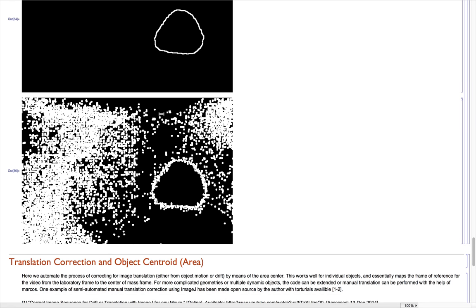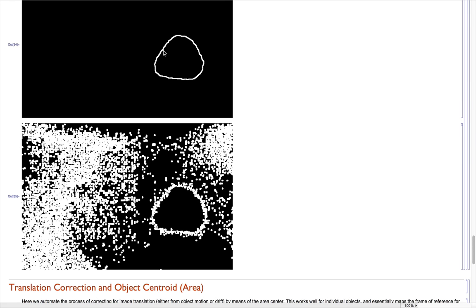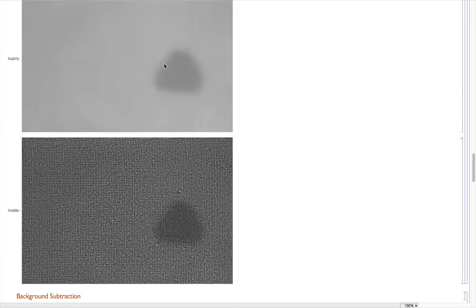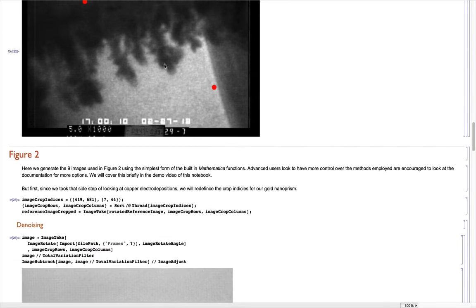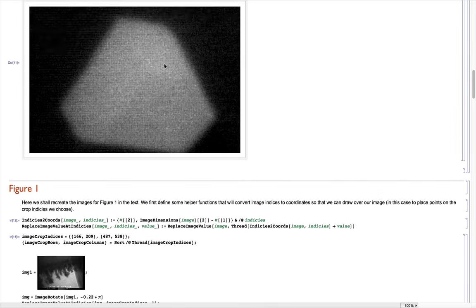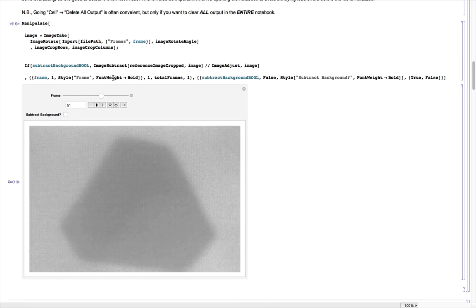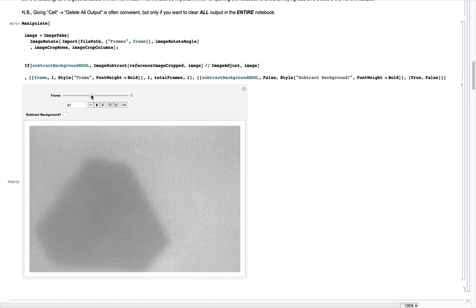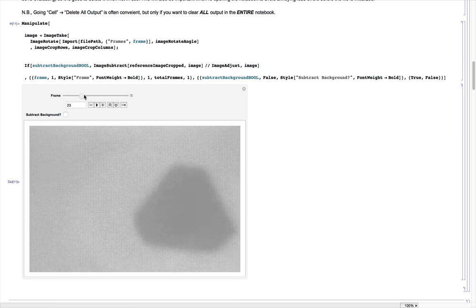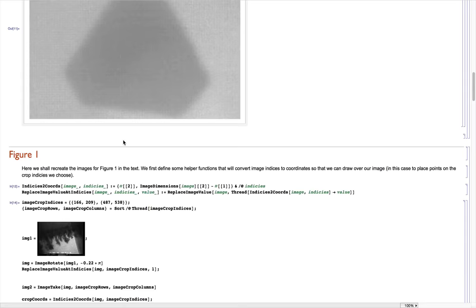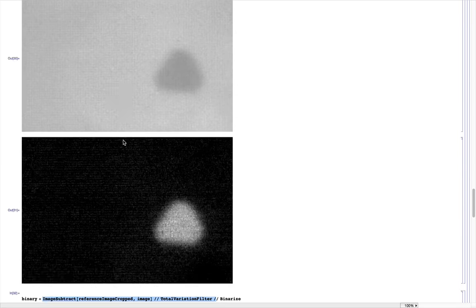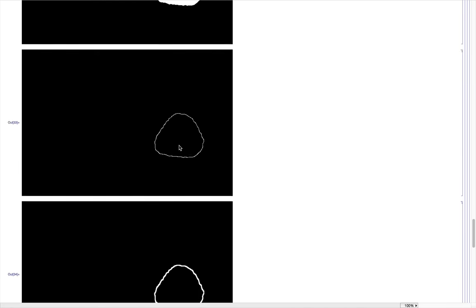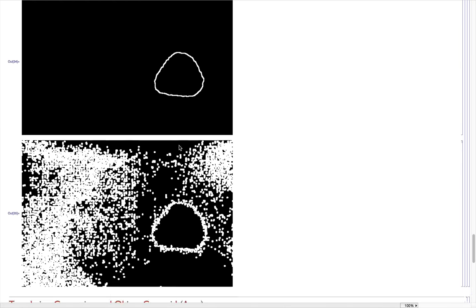Now one thing that happens is sometimes these objects move. If we go back up top to the original video, I'm going to turn off background subtraction. This is the raw data that's just been cropped. We see that this crystal jumps around a little bit. So we might want to correct for that. One good way to do this, an easy way to do it when you have a single object, is that you can actually use the centroid of this object in order to map the translation of the particle.